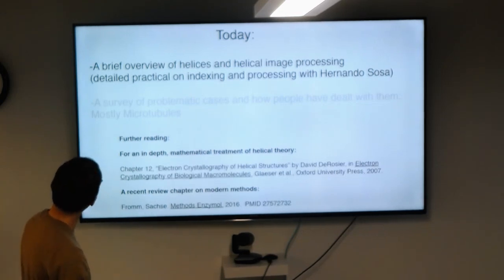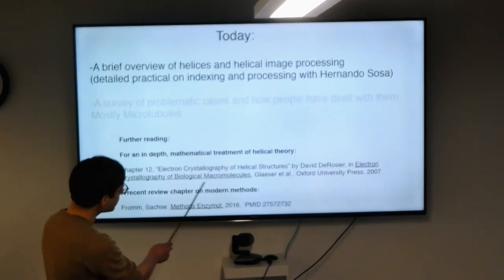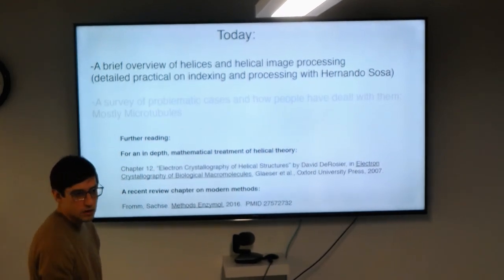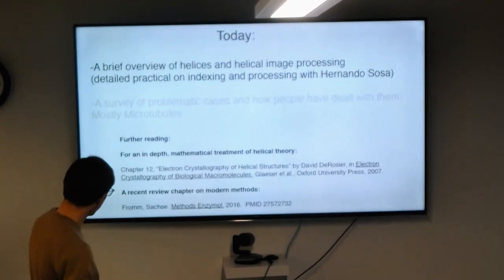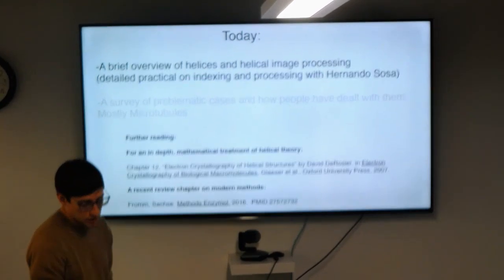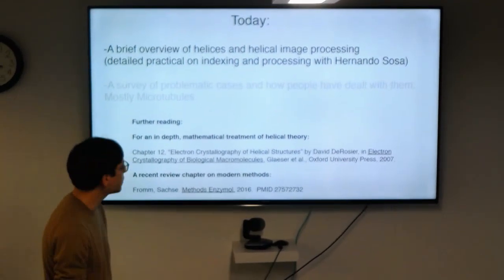So first, we'll start with a brief overview of helices. And I just put a couple references here if you want to get into more depth. I think this chapter in Bob Glaeser's book by David DeRosier is really a fantastic resource if you want to get into the math of helical diffraction. And this review chapter by Carsten Sachse is a really useful resource for a lot of the things that I put in here today, if you want to go into the more modern methods of helical processing.